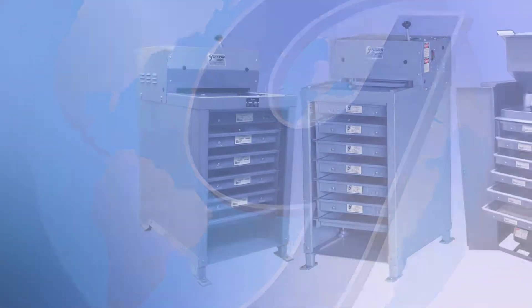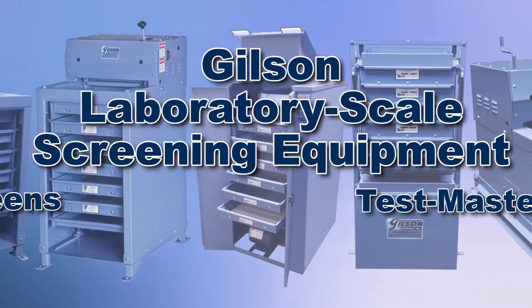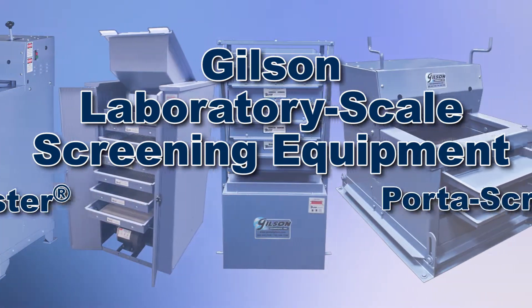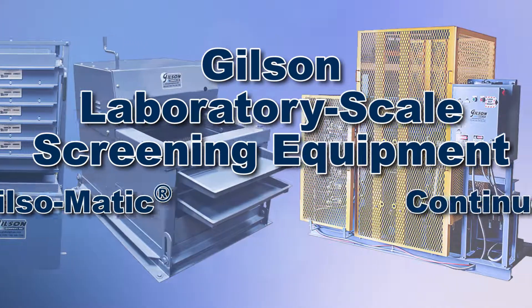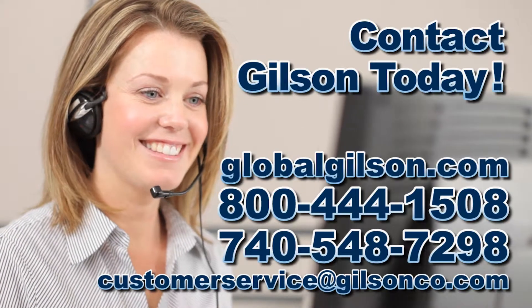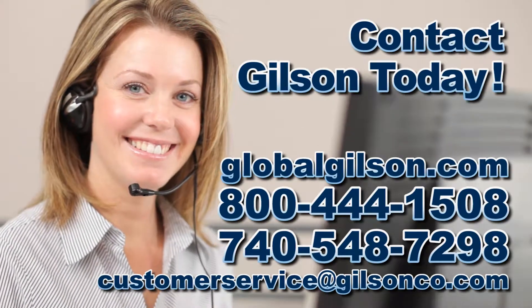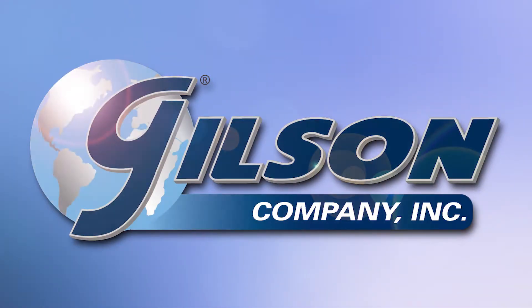Gilson offers a complete selection of laboratory scale screening equipment with a wide range of performance, features, and capacities for fast, accurate, and reliable particle size separations. Be sure to check out all our products listed in the Gilson catalog and on the Gilson website. Gilson — your industry leader for material testing equipment.